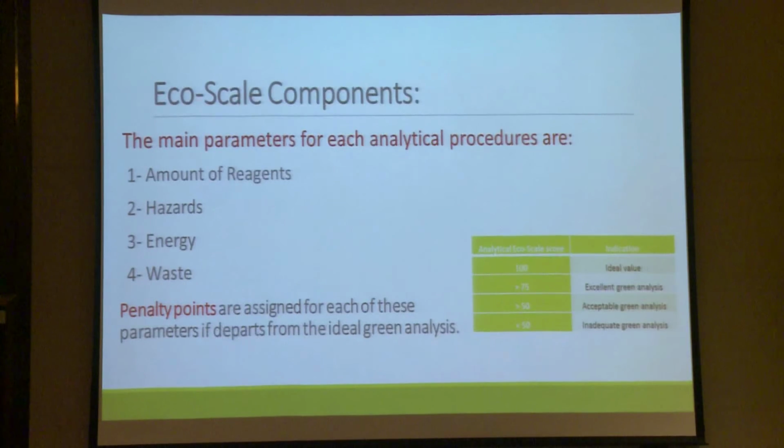So if the analytical eco-scale is 100, it's ideal. If it's more than 75, it's an excellent green analysis. If it is greater than 50, it's acceptable. Less than 50, it is inadequate.